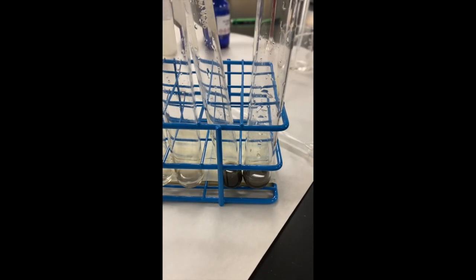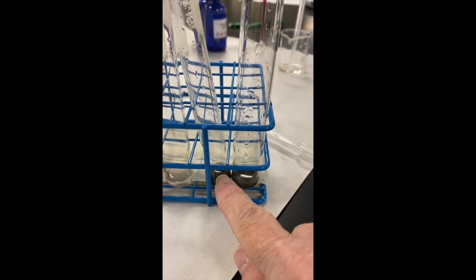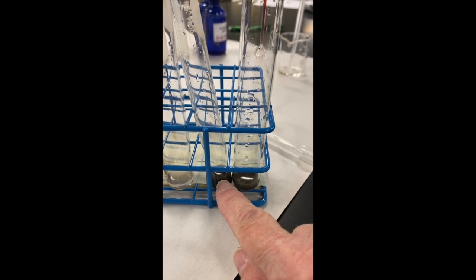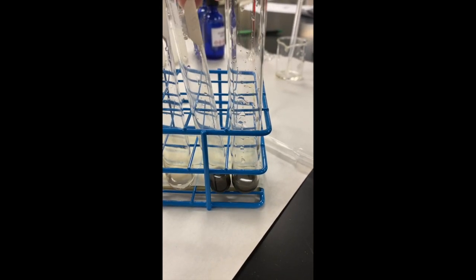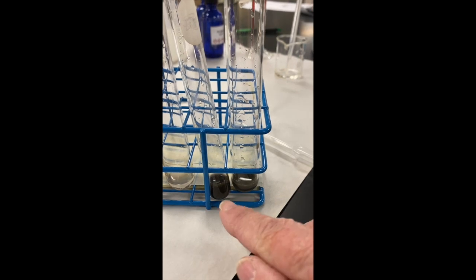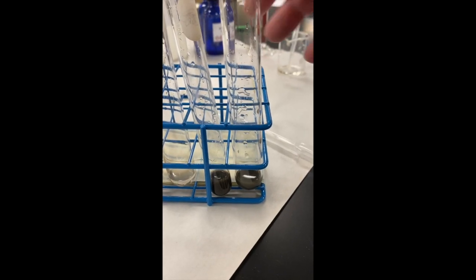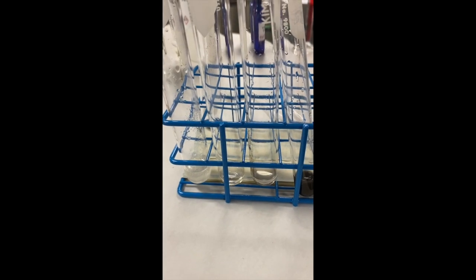But right off the bat, I saw a big difference on formalin, which is a form of formaldehyde. Immediately when I put in the drops, it turned this dark color and the same thing with acetaldehyde. These other three, we're going to see what happens.